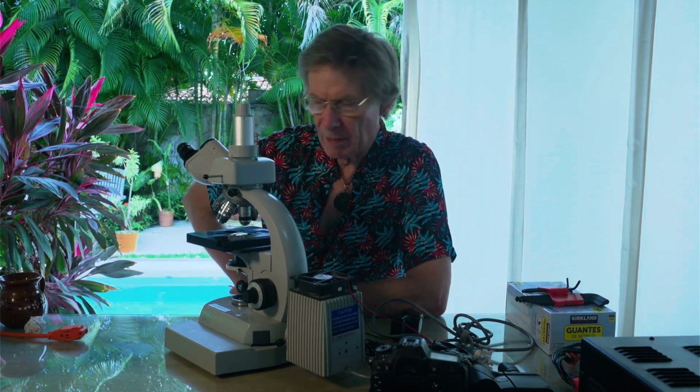We will be moving up very shortly to an LED light system, which has been developed by a company in the United States for older microscopes and newer microscopes as well, but older microscopes much more specifically. And the LED light source will not have those issues and will give extremely high light power and resolution for a microscope like this.